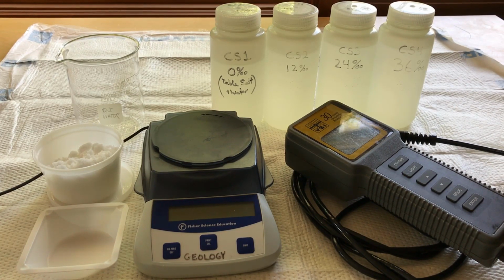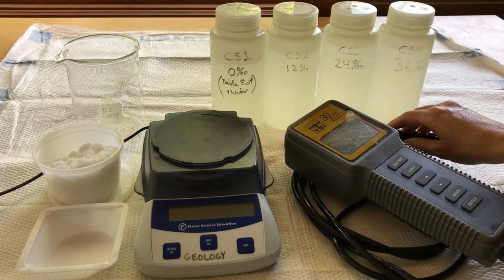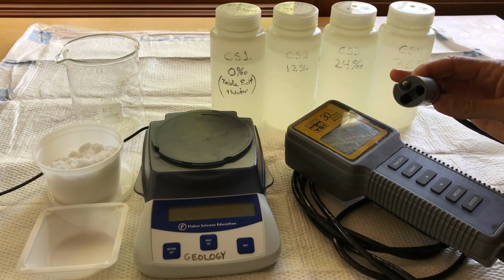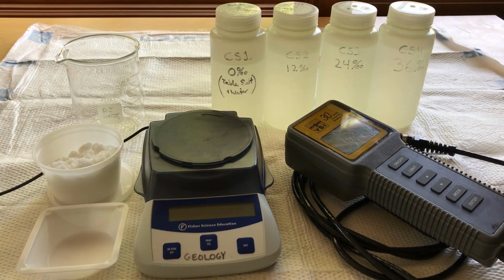Alternatively, we can measure salinity using a meter, based on the fact that the conductivity of an electrical current through a liquid is highly correlated to the liquid's concentration of dissolved solids, like sodium and chloride. In other words, the saltier solutions will better carry or conduct an electrical current. A conductivity meter measures precisely how much of its battery's current is conducted across its two small metal plates when the plates are submerged in a solution. This measure of a solution's conductivity is reported in units of either microsiemens or millisiemens.